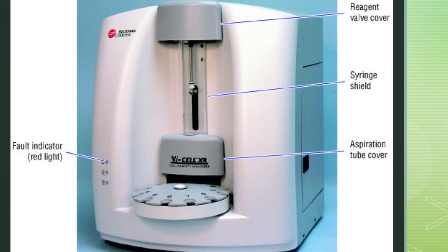Looking at the front of the machine, we see four different distinct areas: the reagent valve cover, the syringe shield, the aspiration tube cover, and the fault indicator.